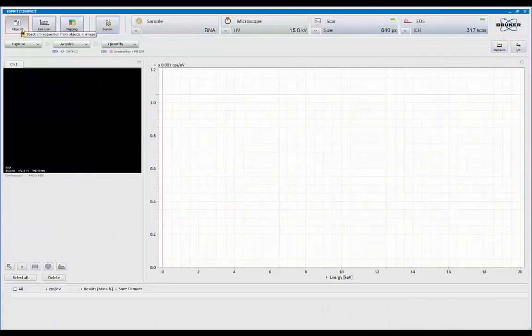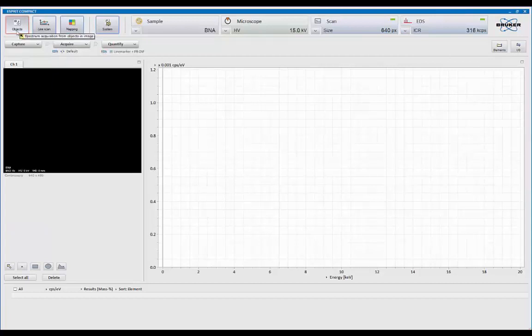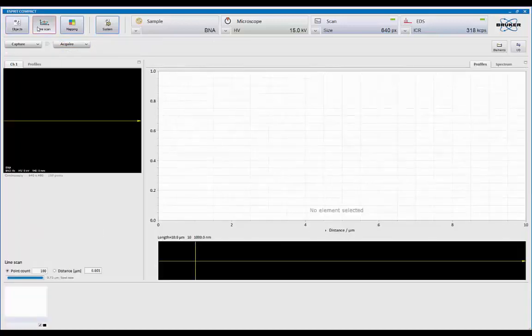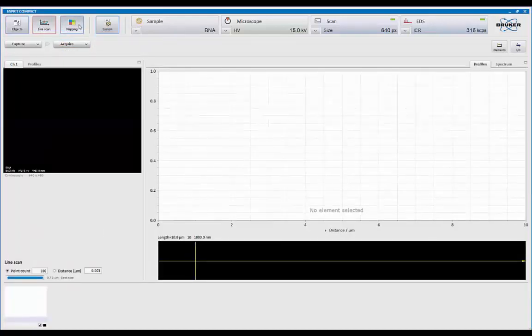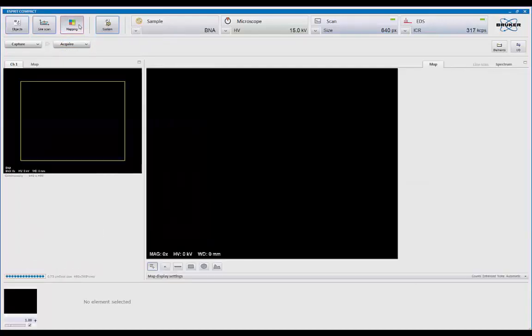So we have three basic acquisition modes: Object mode, where we can collect the image and annotate it for spectral acquisition, digital line profile, and digital maps.